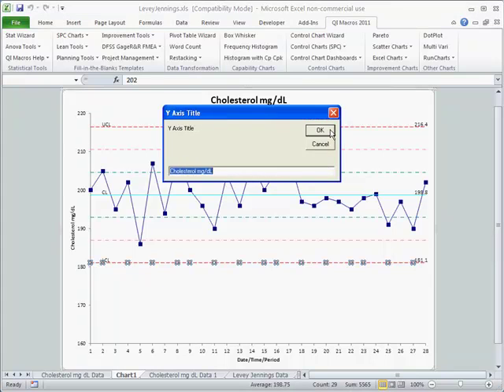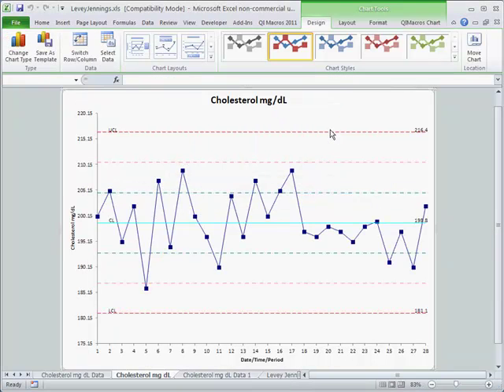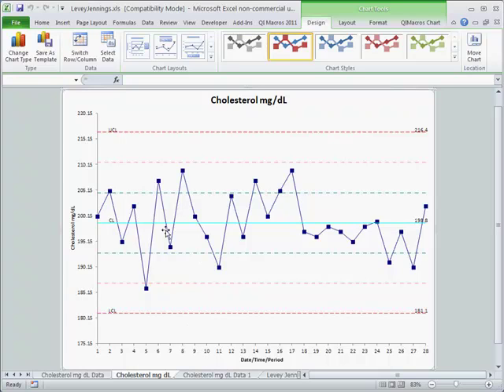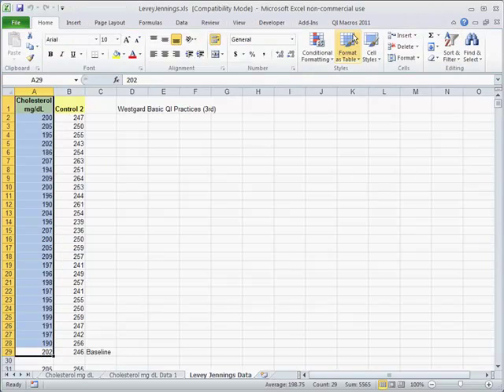This is going to prompt us for our titles. You can see that cholesterol is pretty much standard at 198, which is slightly lower than 200. We had some values that were up a little bit and some that were down a little bit. That gives us one picture.